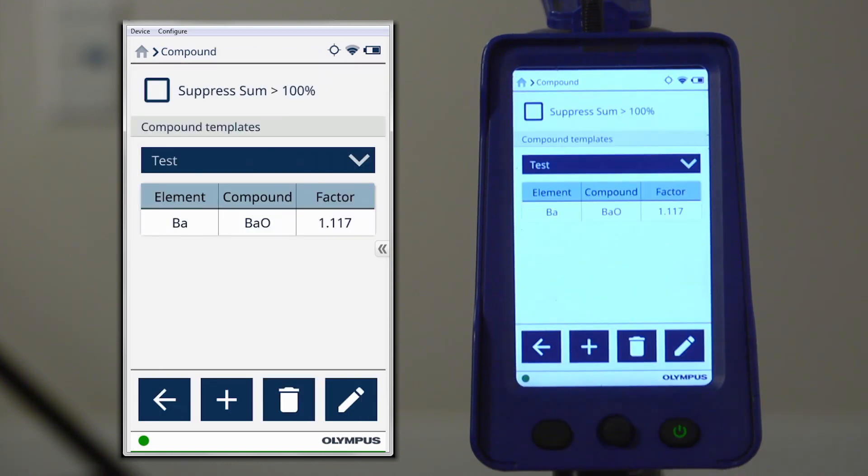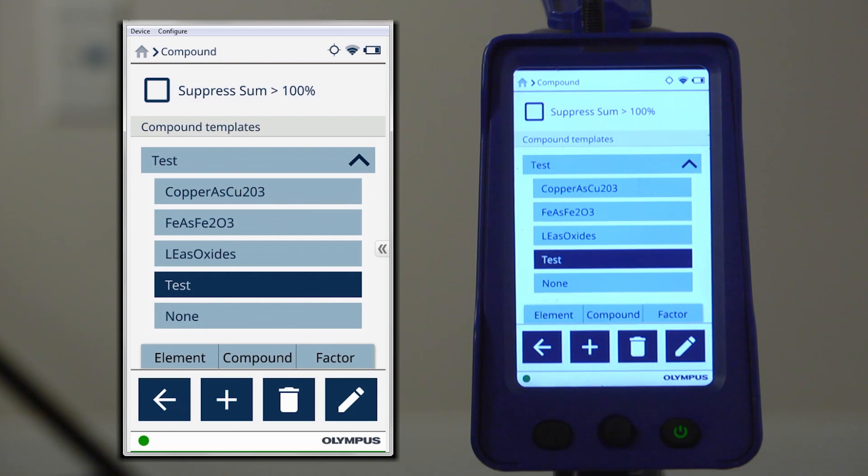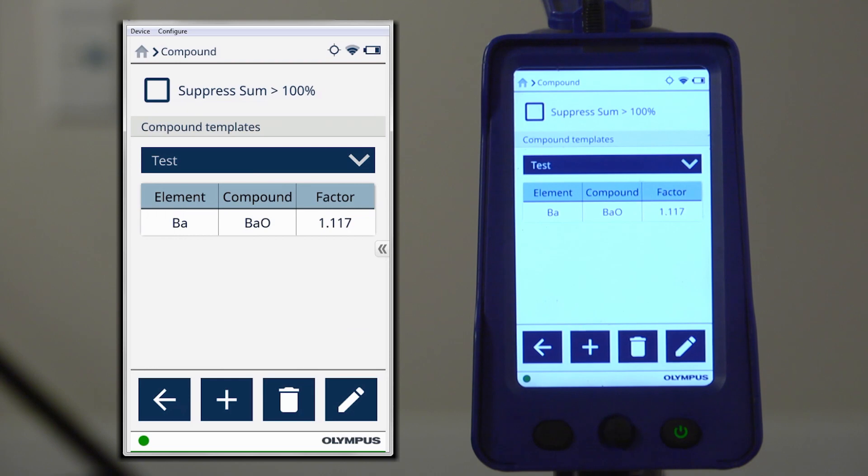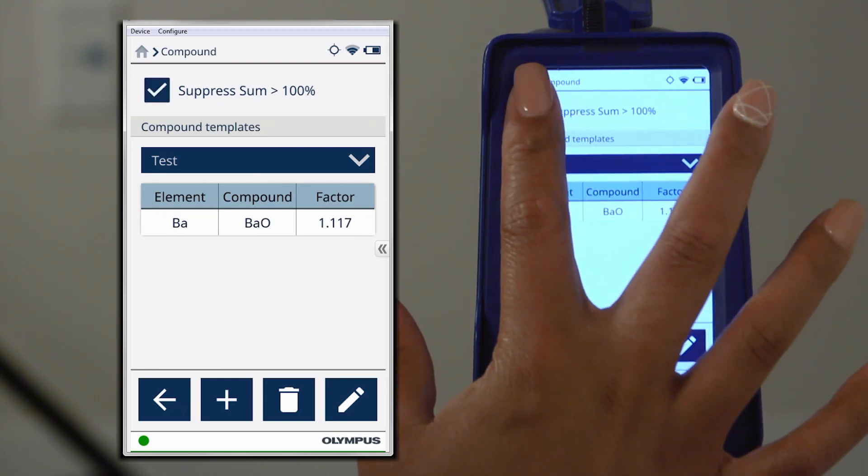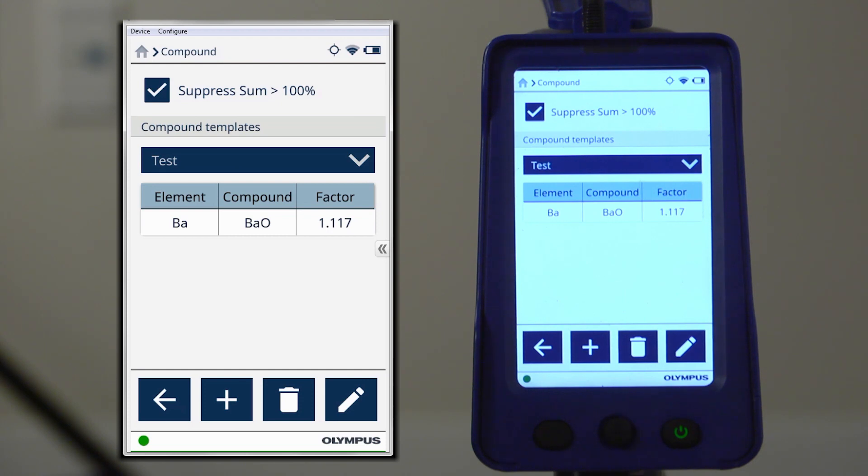Now that we've created our compounds template, select the one you would like to use from the drop-down to activate it. You have the option to use the Suppress Sum Greater Than 100% function to display a message to let you know if your overall concentration is greater than 100%. With that, our template is ready to use in the field.